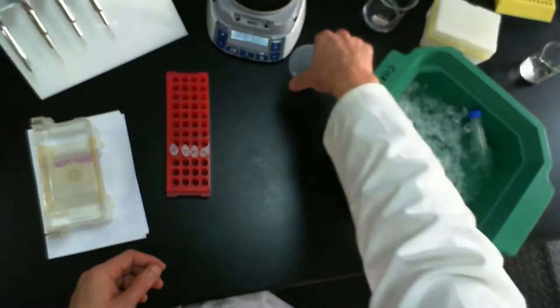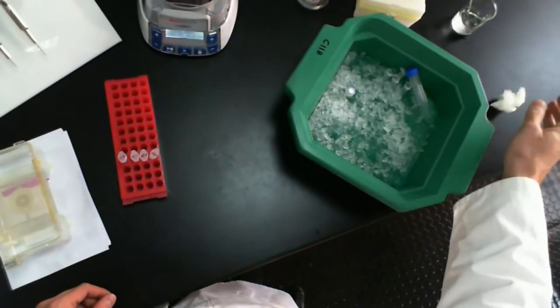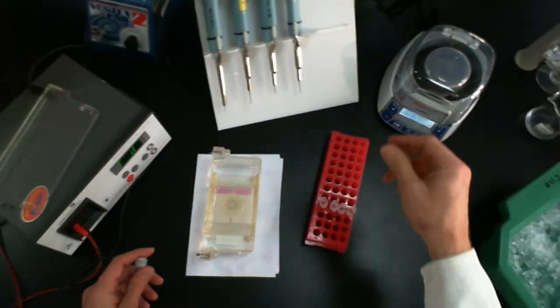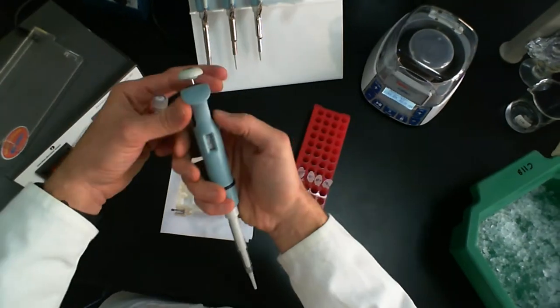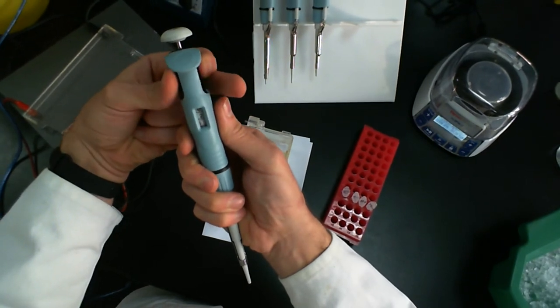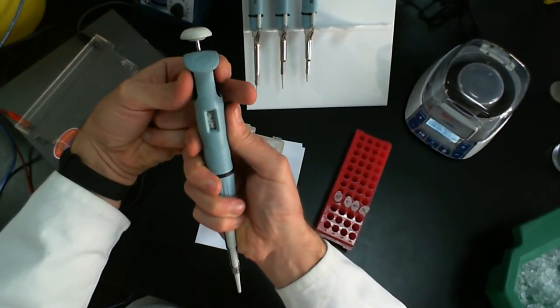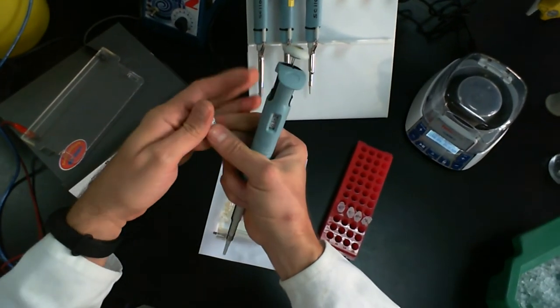So the next thing I'm going to do is add some loading dye to these. The loading dye is going to add some density to the sample. That's why we want to add this, to make sure that our samples are a bit more dense, so they sink to the bottom of the wells. I'm using a P20, and the dye is a 5x dye, so we need 5 microliters of it. So it's going to be 1x at the end when we have 25 microliters.